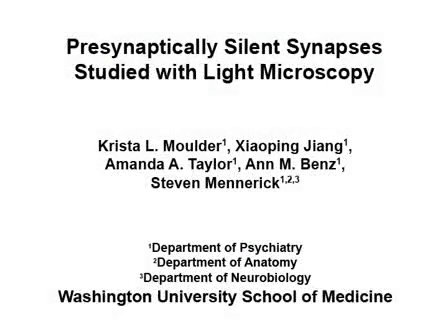Some presynaptic terminals in the central nervous system appear non-functional, or silent. Here we present a protocol for identifying silent presynaptic terminals. This protocol can be applied to identifying treatments and manipulations that are suspected of silencing or awakening terminals.